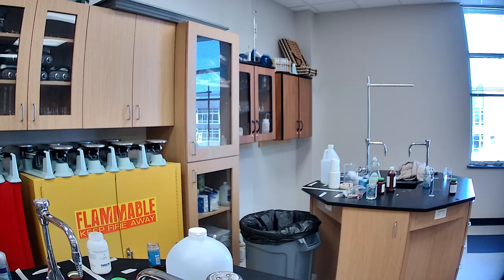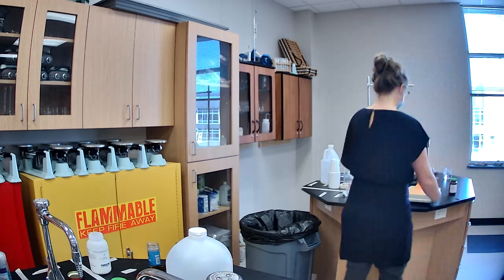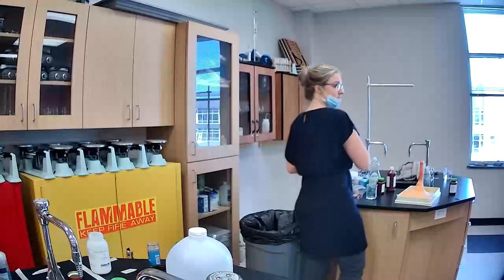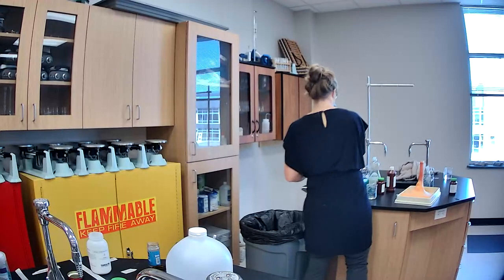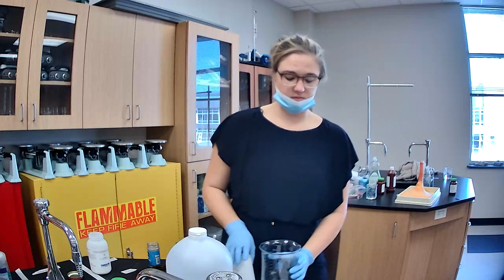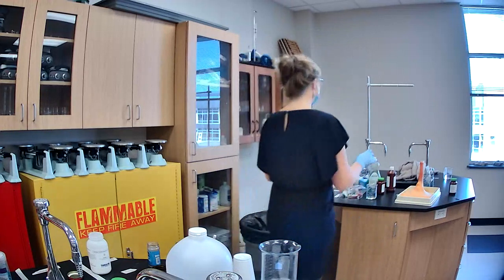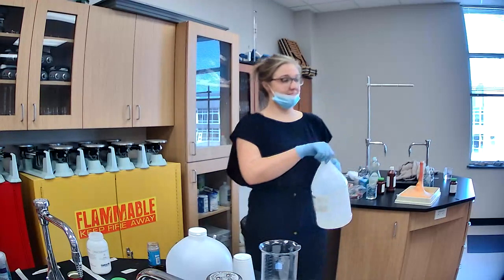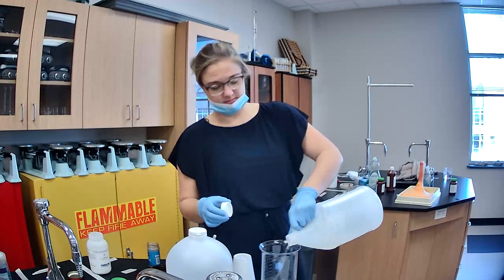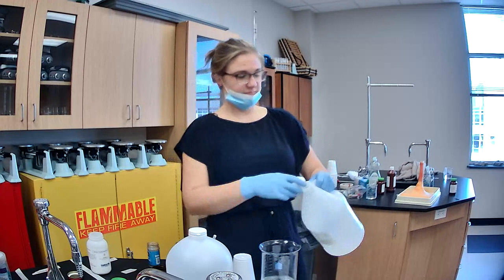I'm almost out of catalyst. It's getting hotter. Yes, like you said, the catalyst causes the oxygen to escape really fast. Normally in hydrogen peroxide, it takes a few hours for it to escape. But when you add the catalyst, it makes it do it really fast. And normally it just goes, but when you add soap, it goes. Exactly. And I first learned about elephant toothpaste from Mark Roberts.